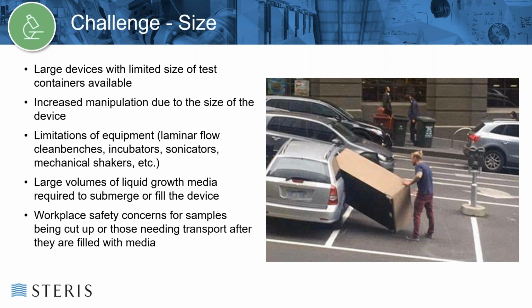Large volumes of liquid growth media required to submerge or fill the device can create some workplace safety concerns, as they can become quite heavy, and if they are disassembled or cut up, it can lead to some repetitive stress or injuries to the hands through cutting those materials, which can be sometimes very durable.